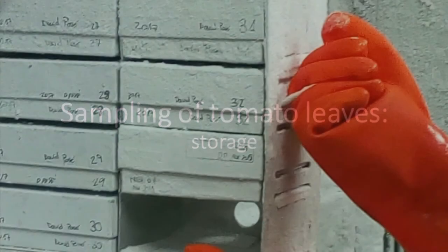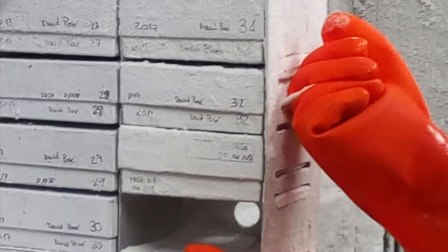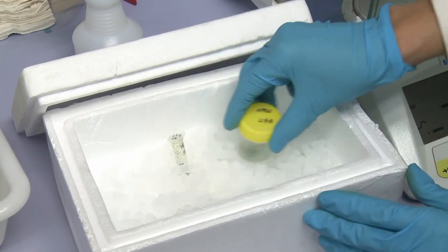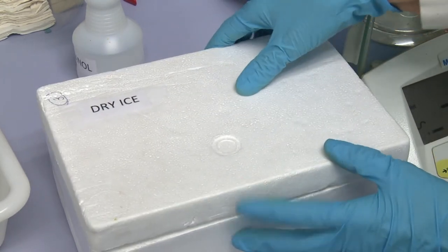Finally, store at minus 80 degrees Celsius the samples that are already weighed and prepared for the metabolomic analysis. The remaining powder can be kept for further analysis in the same conditions.